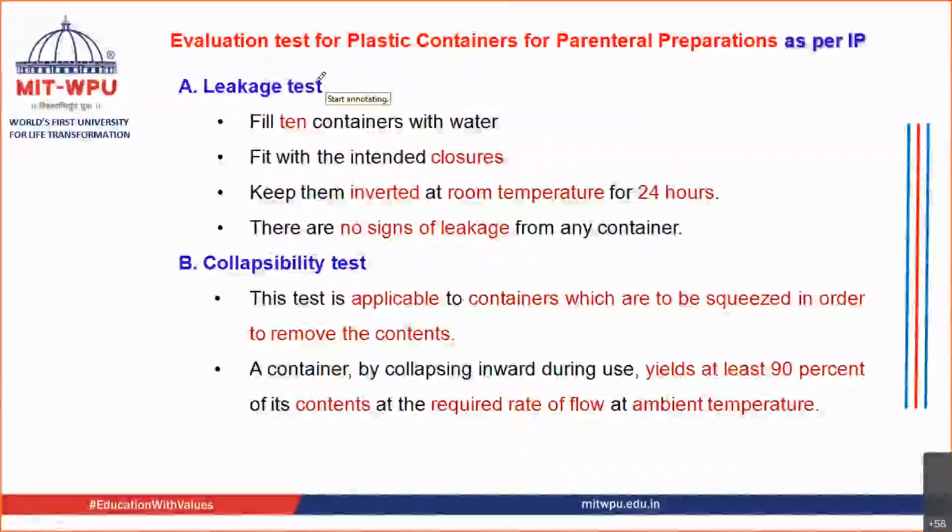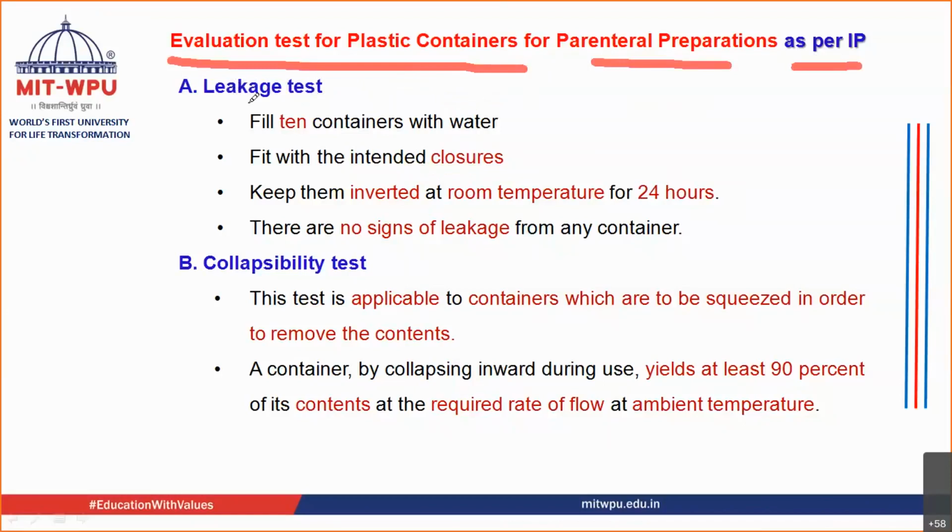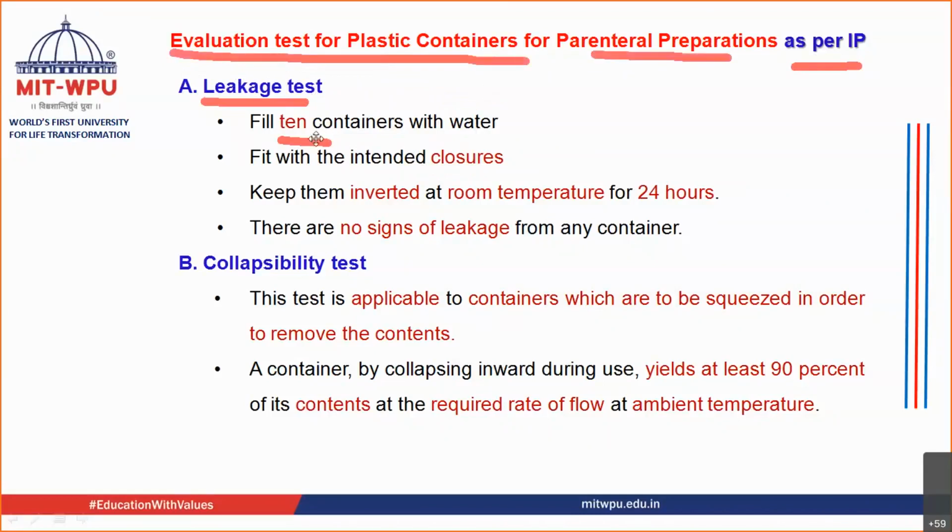Now the first evaluation test that is carried out for plastic containers for parenteral preparation as per IP is the leakage test. What do you do in this? You take 10 containers which are under evaluation, the plastic containers in which you are going to pack your parenteral preparation.